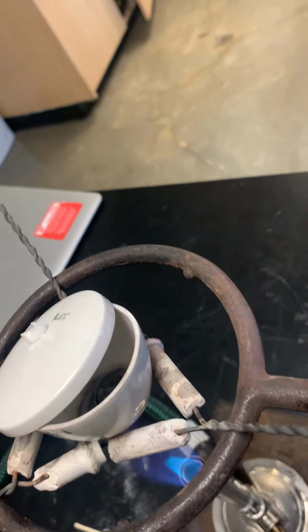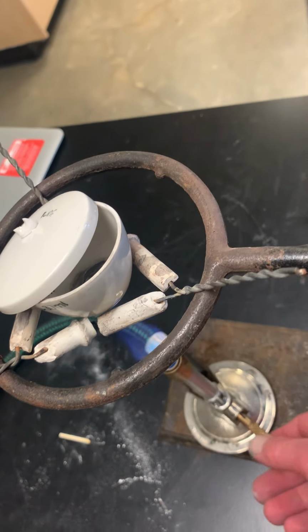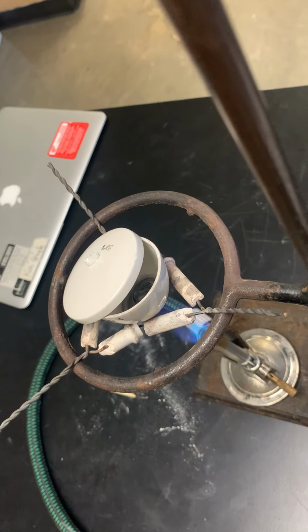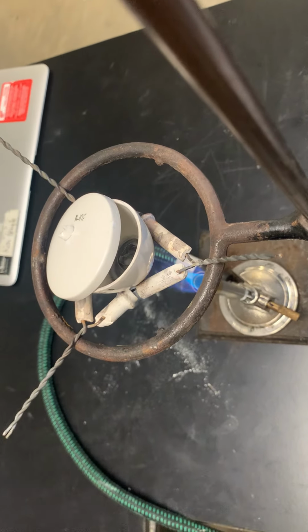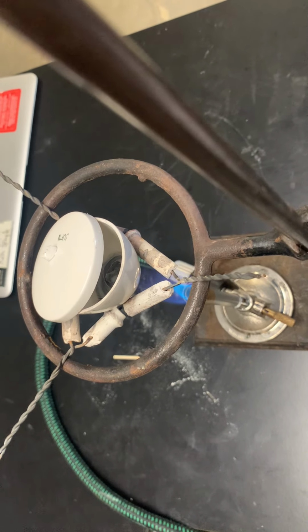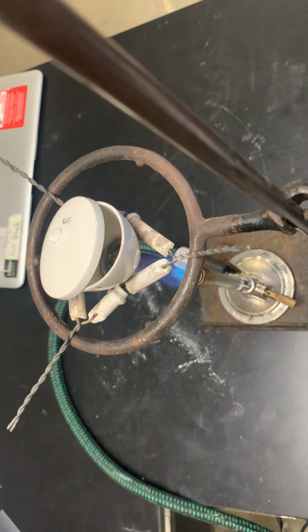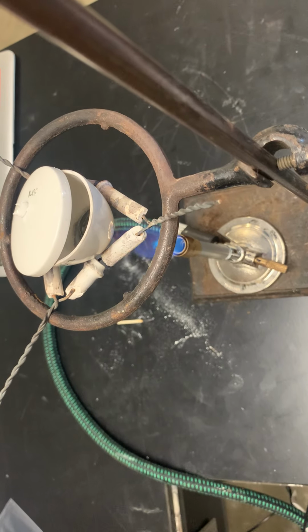So there we go. So this takes a little bit of time. I'm going to heat it up a little bit hotter. And what's happening is we're just really heating up the container. And that's supposed to last for 3 minutes. I don't know if I have the patience for 3 minutes of video of heating.